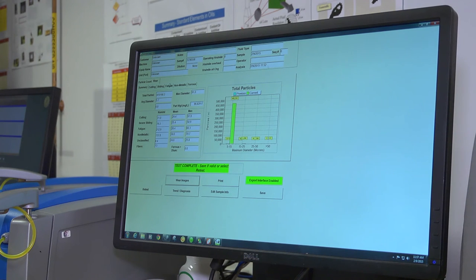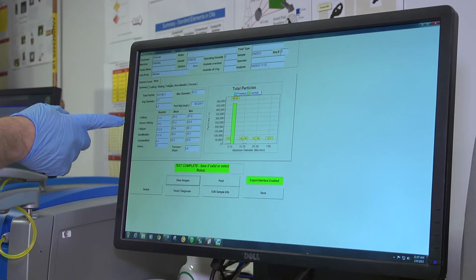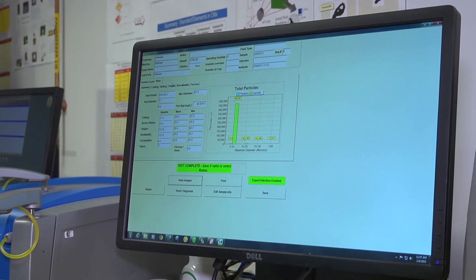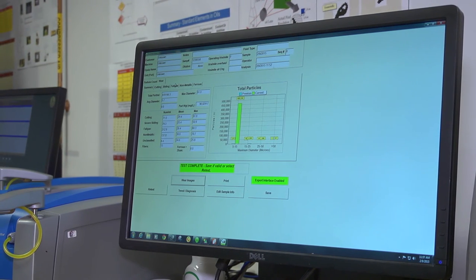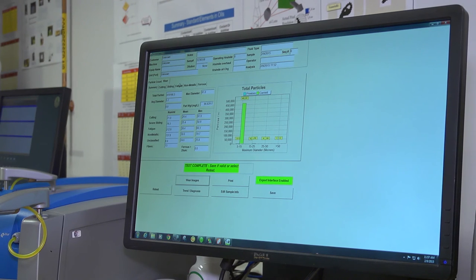So let's look at those results. We looked at the wear images. You can see here that not only did we capture the image, but there's an actual count of the cutting, severe sliding, fatigue, non-metallic, and fibers.